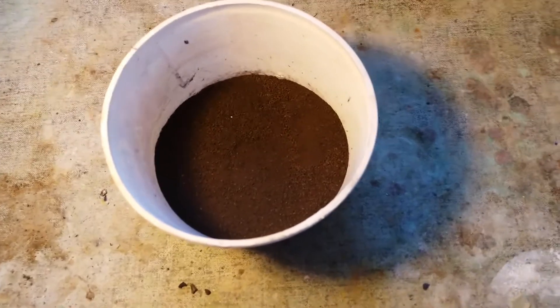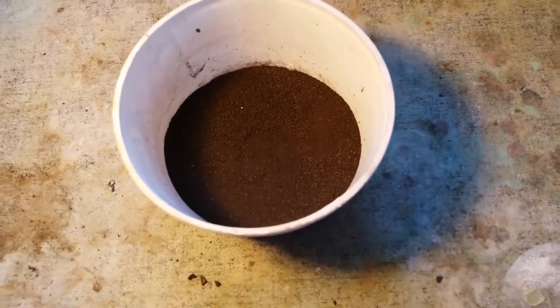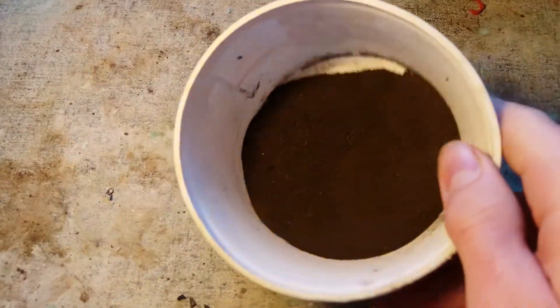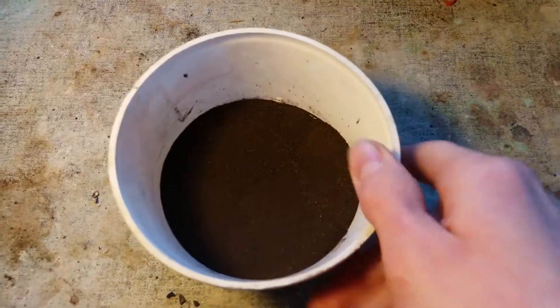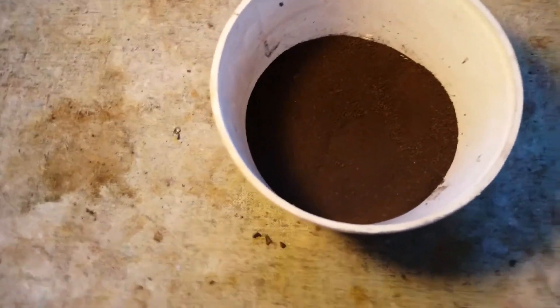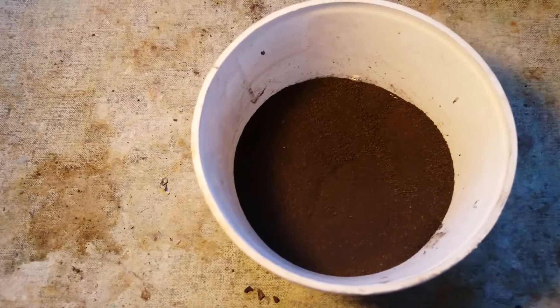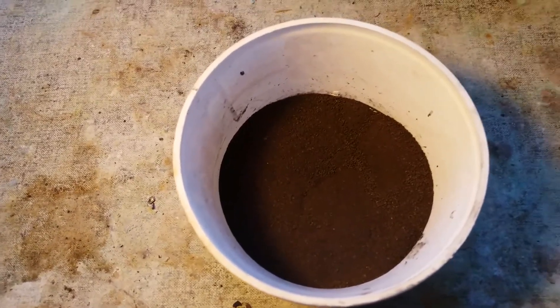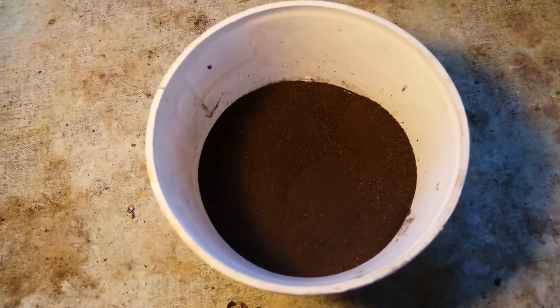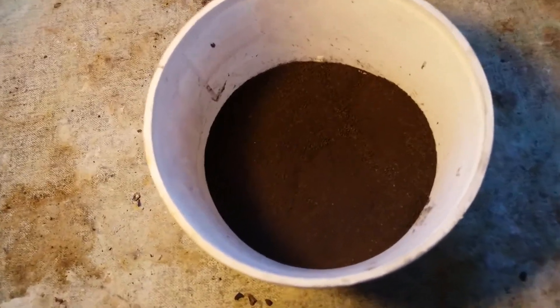This is all the manganese dioxide I obtained from those batteries. It came out to be around 160 grams. Well, it's not mostly manganese dioxide — it's probably mostly manganese reoxide, that is Mn2O3, because those batteries I used were already pretty used up.